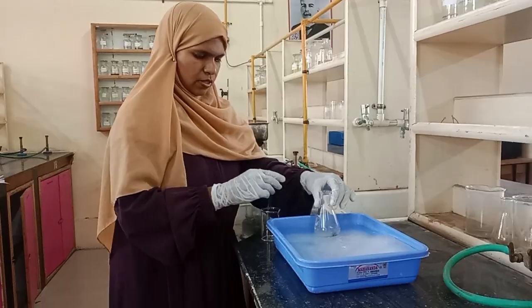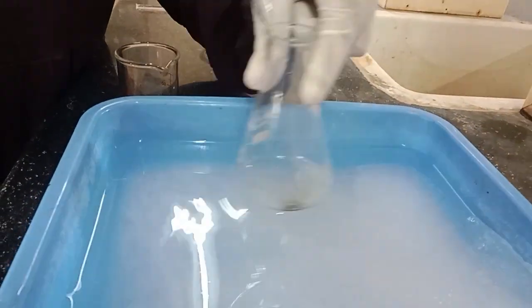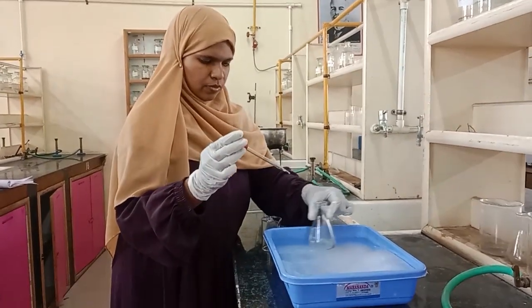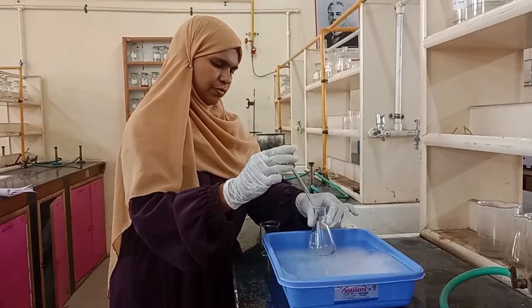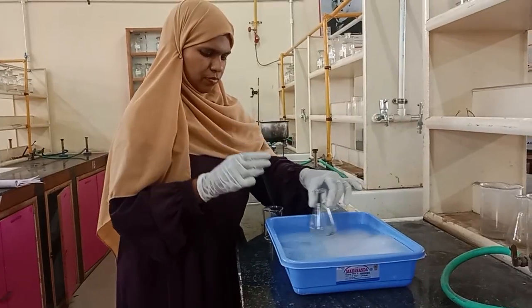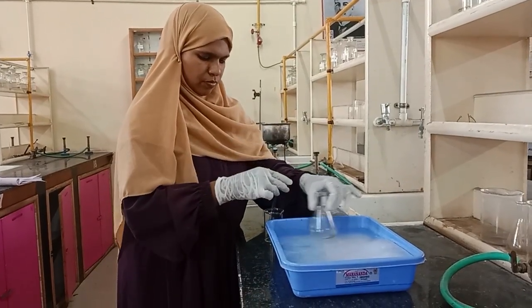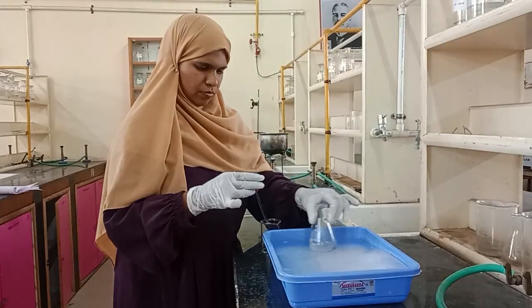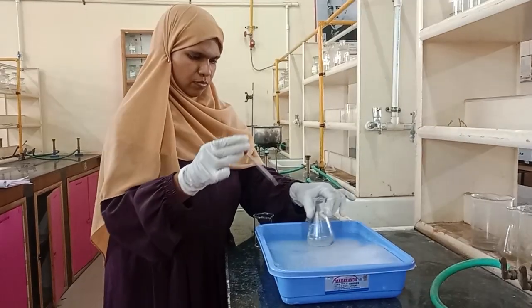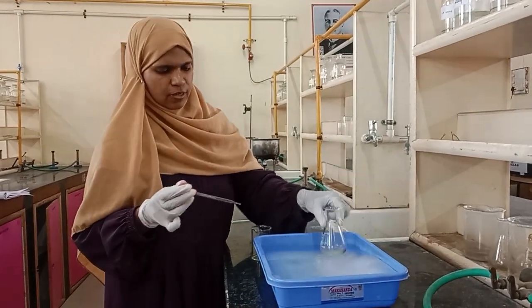You can observe this clear solution changes into a cloudy one after the addition of acetophenone with continuous stirring. Now the addition is completed.